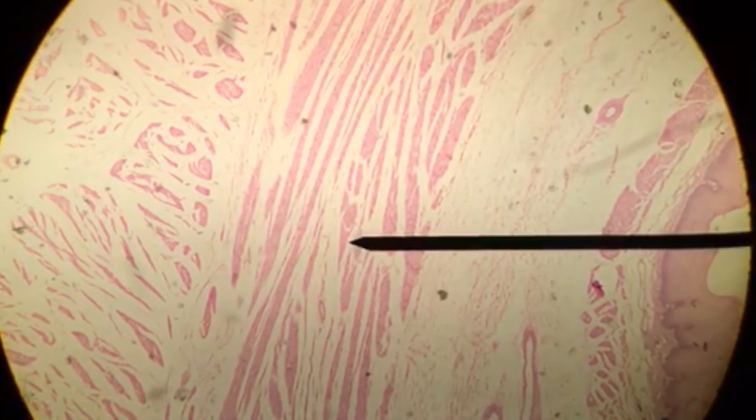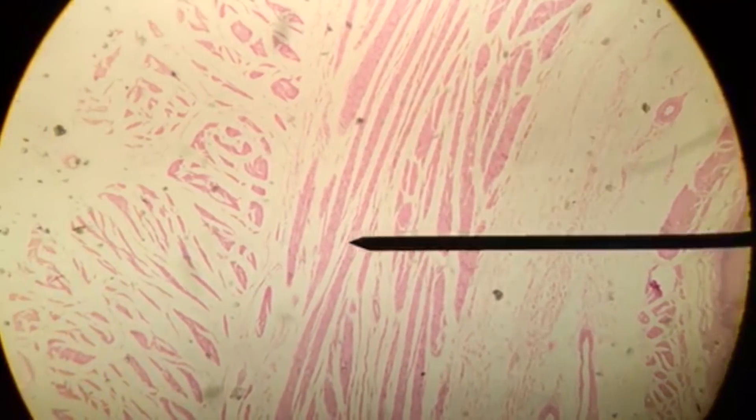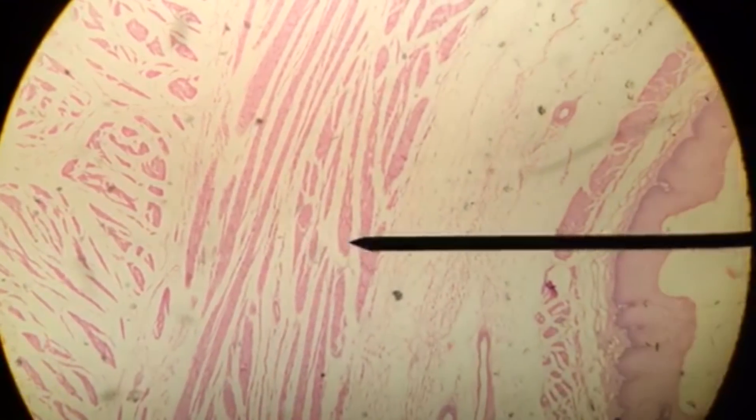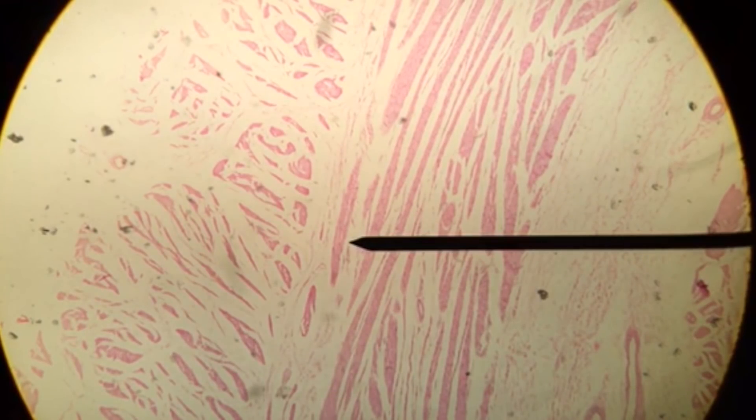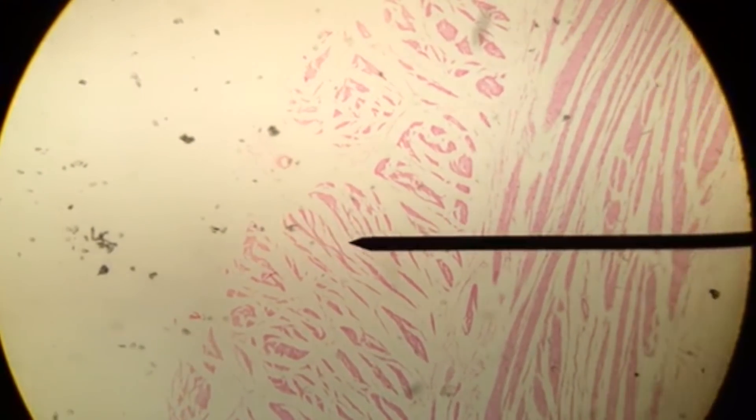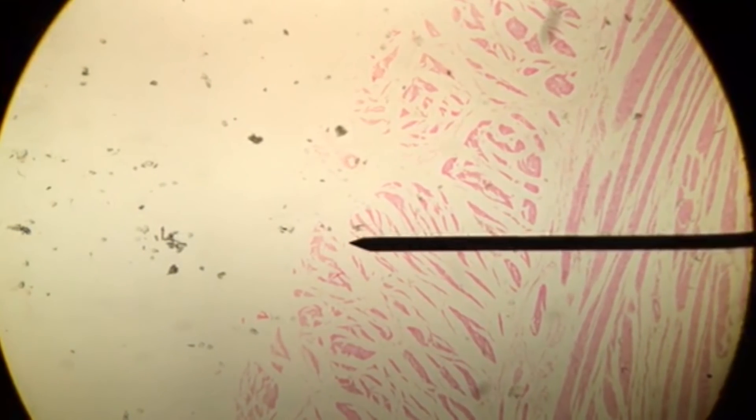The underlying layer underneath that submucosa is the muscularis. It is divided into two layers. This is our first circular layer, a circular arrangement of smooth muscle fibers. The layer underneath it will be our longitudinal layer, or second layer within our muscularis.